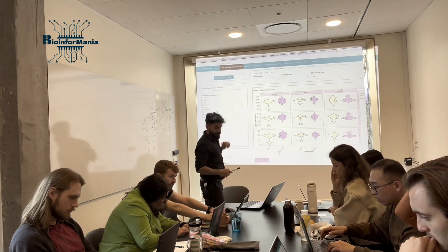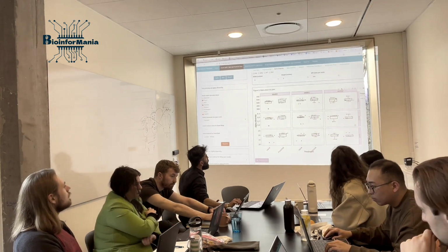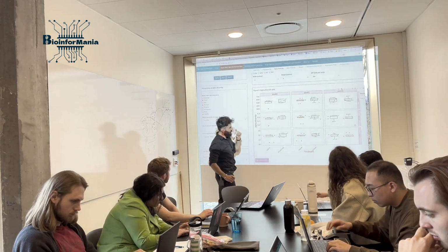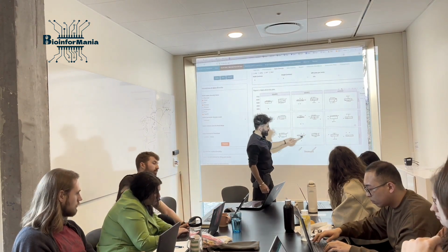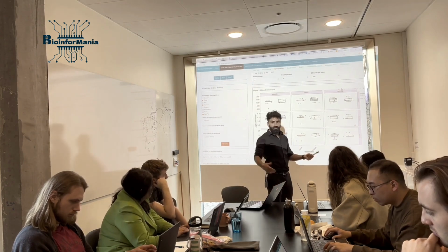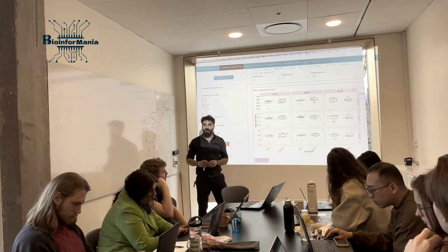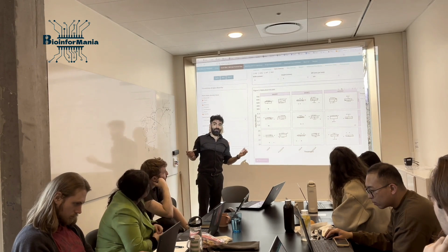Now I'm going to base on this. If you deactivate these densities, just take a look at the box plot, the empty box plot. You can see that in week 0, we already have a bit of a difference in the protozoa compared to naive. And then in week 1, we have almost the same, just by naively looking at it, okay? And in week 2, which is like the third week of our experiment, the mean of protozoa for almost all of these alpha diversity indices is actually lower than the one for naive, okay? So is it treatment or is it week effect?